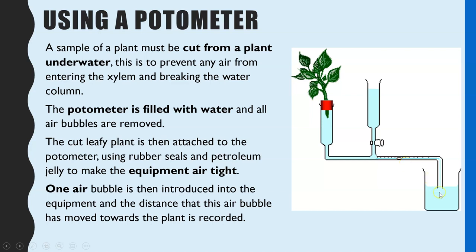The point of that is when that air bubble reaches 0 on the scale on your capillary tube, you can then start your stop clock, and then you can see how far that air bubble travels in a certain period of time.